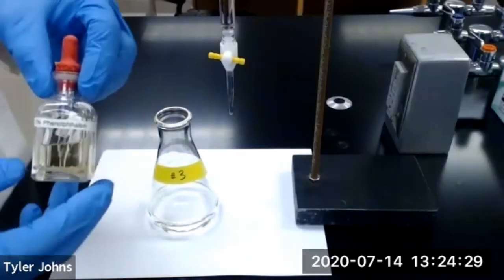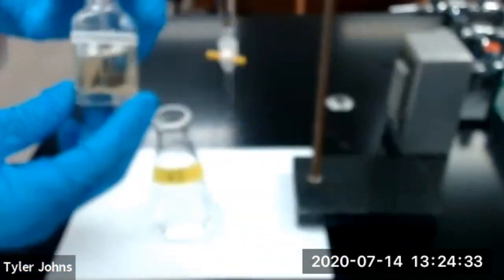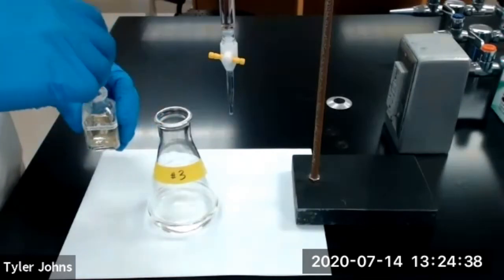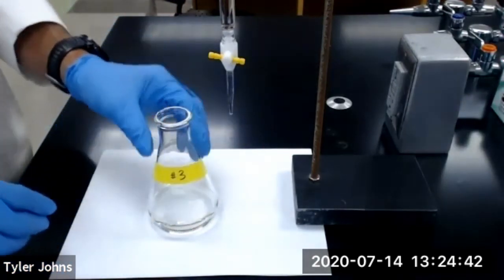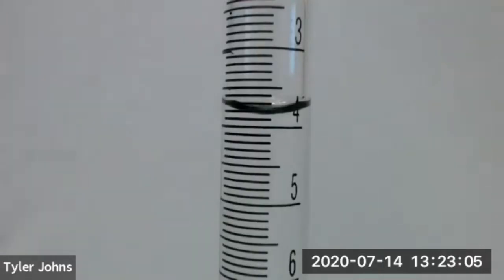Next, add three drops of our 1% phenolphthalein indicator to our Erlenmeyer flask for trial number three. We're now ready to begin titration for trial number three. This is the initial burette reading for trial number three.